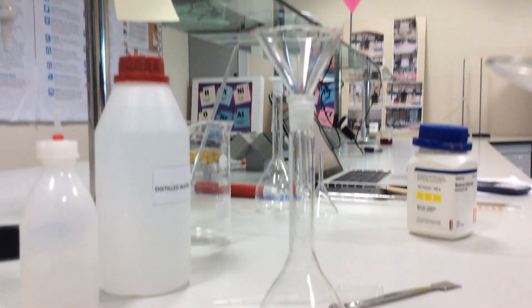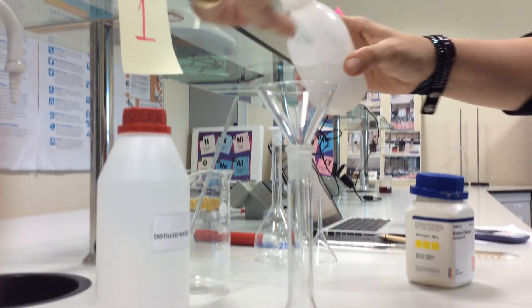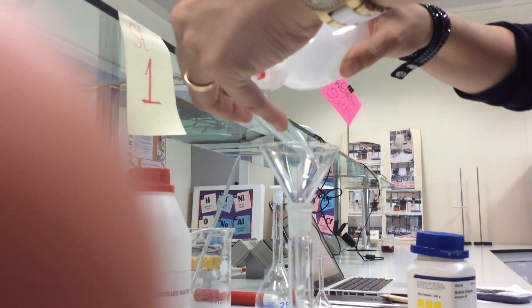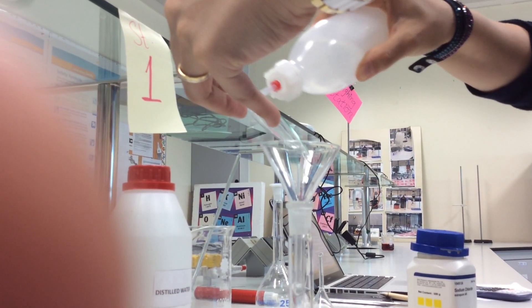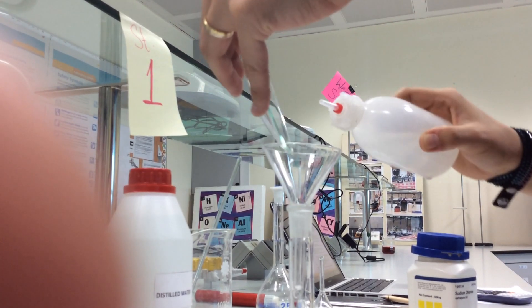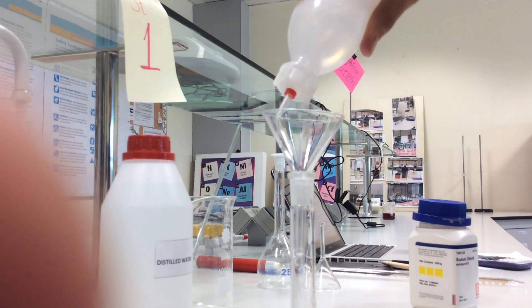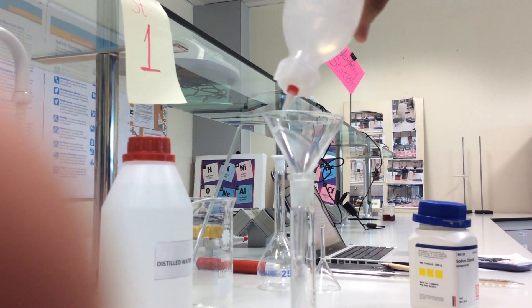With the wash bottle filled with distilled water, I will wash the water glass to make sure that all the 0.73 grams are added. I will also wash the sides of the funnel just to make sure that all the salt is dissolved.